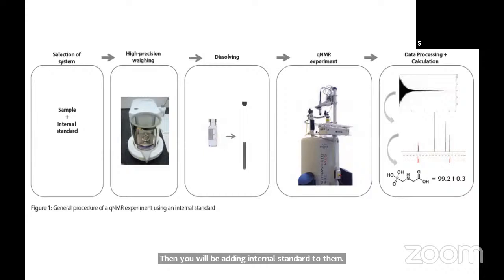Then you go for proton NMR. So once you have done the proton NMR, you go for data analysis, and then you will get the result. It is as simple as that.